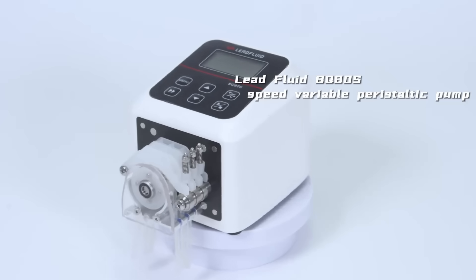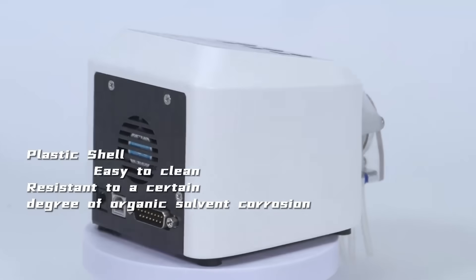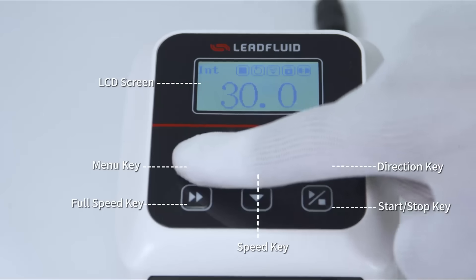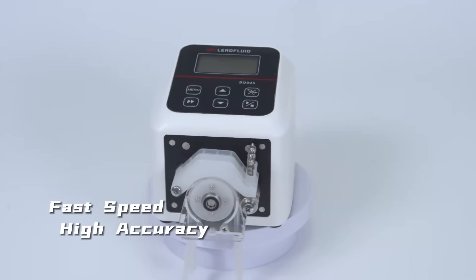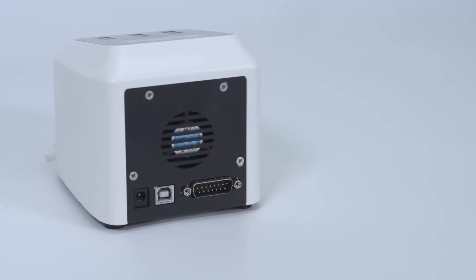Nothing is impossible with leading technology. The Lead Fluid BQ80S Speed Variable Peristaltic Pump has an injection-molded plastic shell, resistant to a certain degree of organic solvent corrosion. Its LCD display combined with key operation makes it easy and simple to use. Using the Cortex-M3 core processor, the running speed is fast and the device speed accuracy is high.